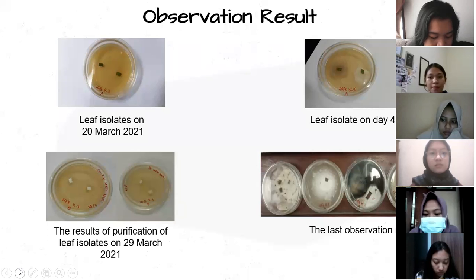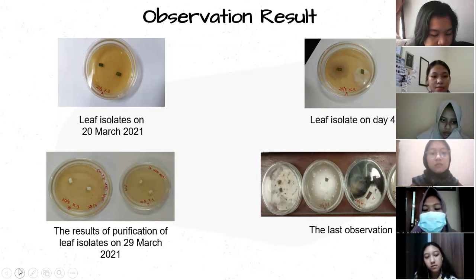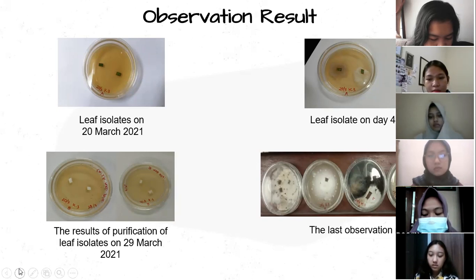Okay, these are the observation results. The picture on the left is the leaf isolate on 20 March, and the right one is the leaf isolate on day 4. And the last one is the result of the purification of the leaf isolate on 29 March, and the last picture is the last observation result.